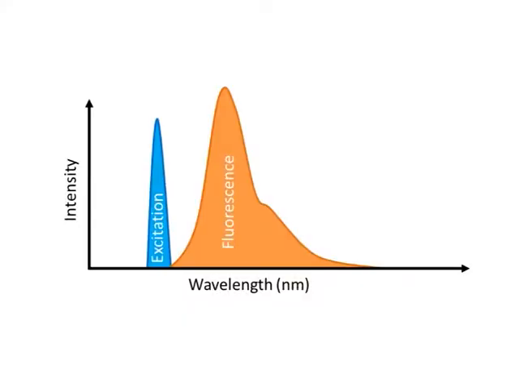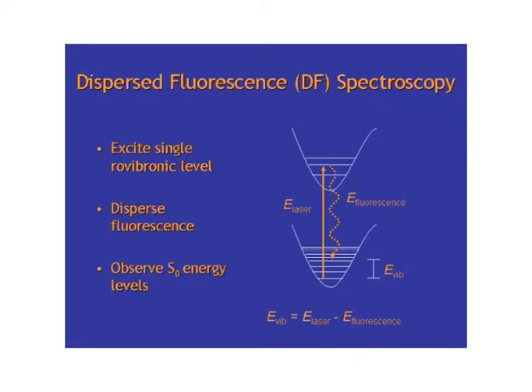When light from an exciter source falls on the surface of an object, the energy is either absorbed or reflected. Selective absorption and reflection may also occur. In selective absorption, the substance absorbs light of certain wavelengths and the rest of the light is reflected. This phenomenon depends upon the properties of the substance on which the light falls.